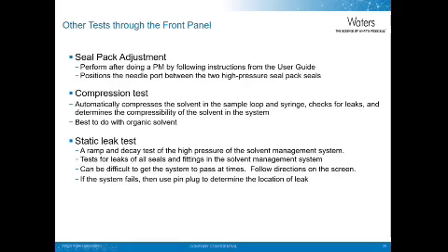Next is the compression test. This automatically compresses the solvent in the sample loop and syringe, checks for leaks, and determines the compressibility of the solvent in the system. This is best to do with organic solvent.